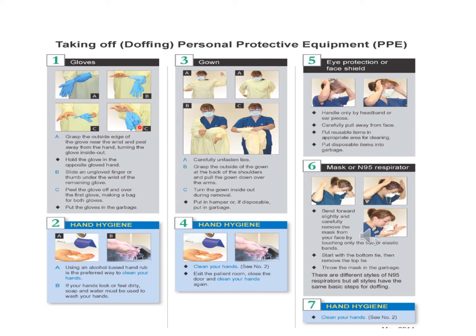Pull them off from the upper side, and cover the contaminated part of the gloves, so the inner side ends up on the outer side, okay, and then dispose of these gloves. Once you remove the gloves, in the second step you have to clean your hands. Thoroughly wash your hands using soap, and after that you can also use some alcohol based liquids that can also disinfect your hands if there is any contamination.